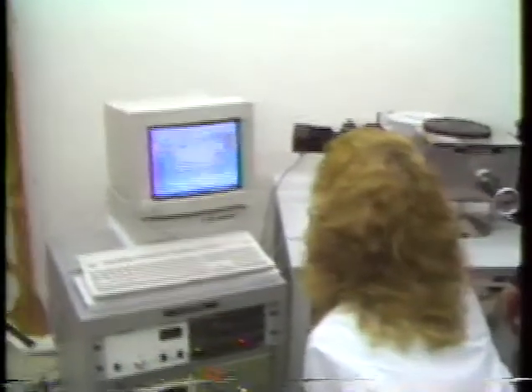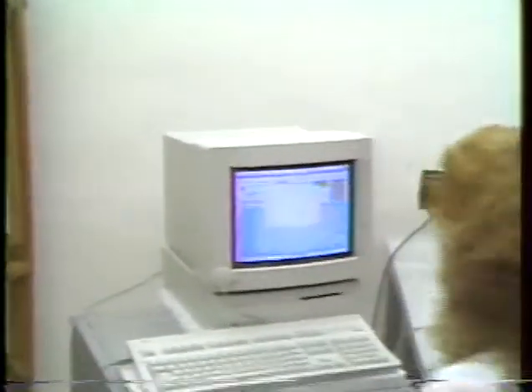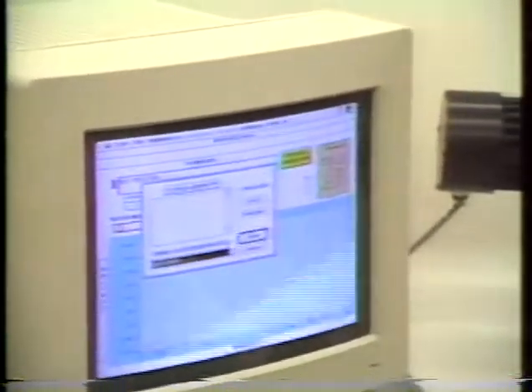You can enter a memo here. That means we can say what we scanned and memorize it. Try that again. Okay. Now save it. Click on this one. Very good. Now you have to name your scan. Fine. So we have a good file for this. And now we save it. Very good.